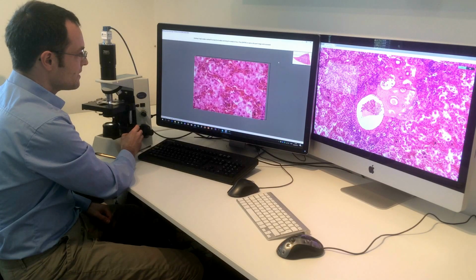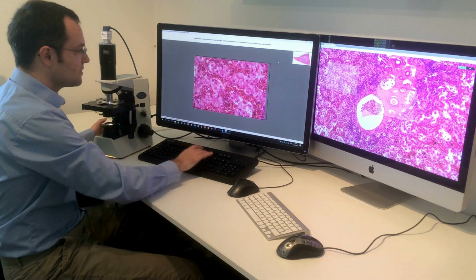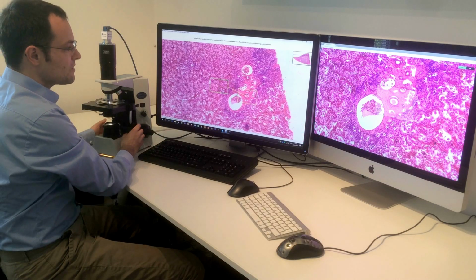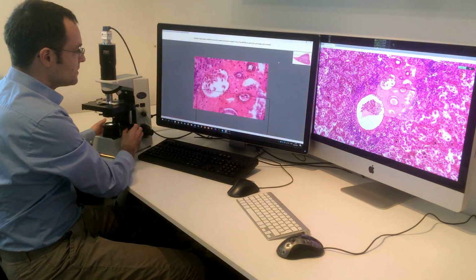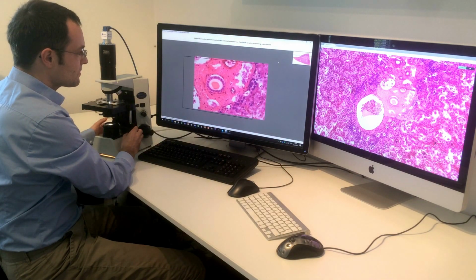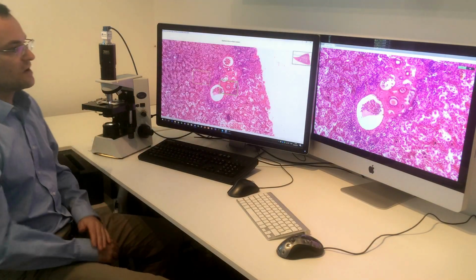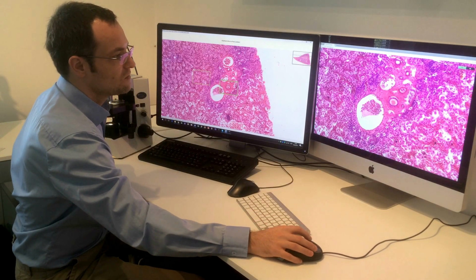Okay, this looks great. Just refocus a little bit to get every detail in focus. Okay, done. And you see here the image appeared. And the other one is still not acquired and it's still waiting, and we are acquiring this image now. Oh, it looks quite nice. Just refocus me. Okay, very good. And now the remote viewer can immediately view this image.